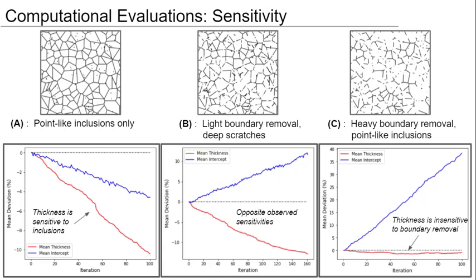For this reason, I think local thickness is a far better, far more consistent metric when you take into account poor segmentations, if those segmentations include relatively conservative detection of grain boundaries, because that's what this third method is made to represent.